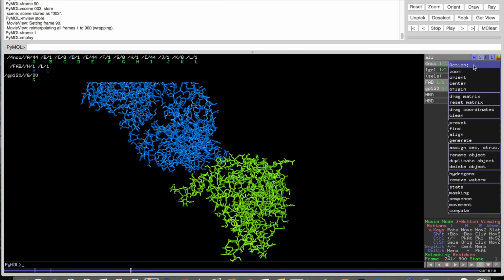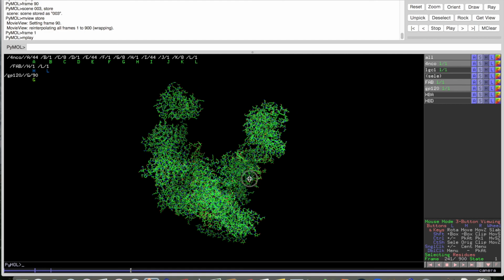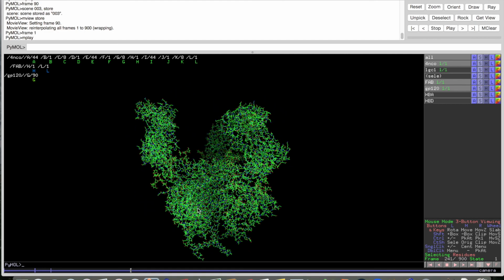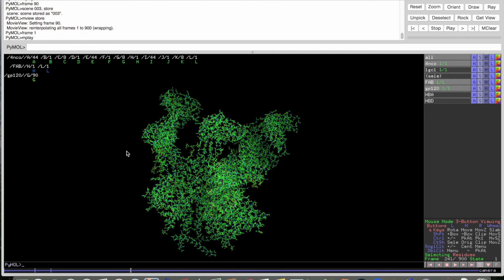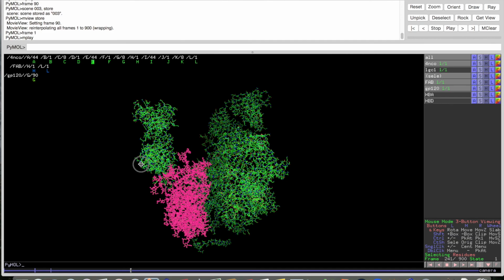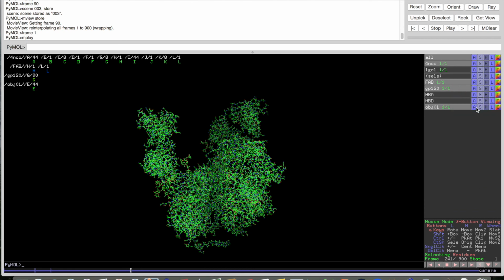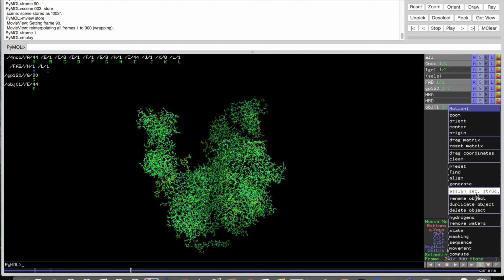Let's actually go to this thing. Over here, I have this trimer. I showed it to you briefly in the last video, I think. This block here is GP120, so I want to superimpose those. Not D. I believe that's it. Perfect. So E, select, extract object. Rename.